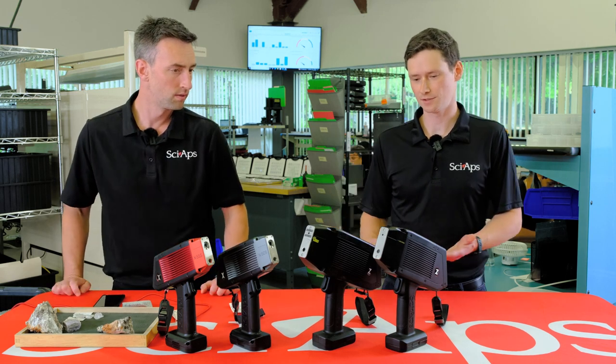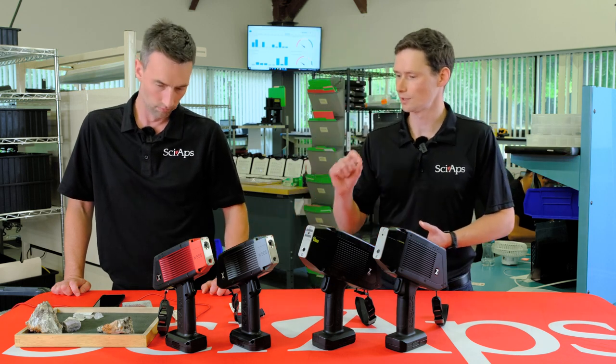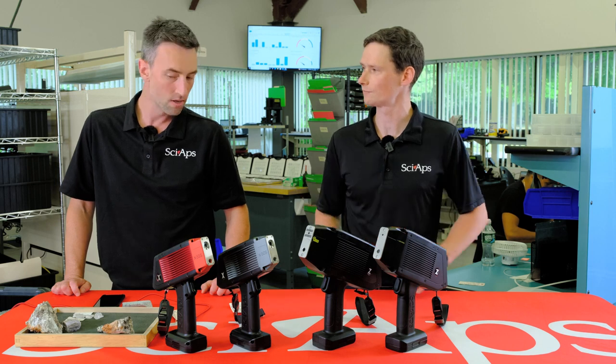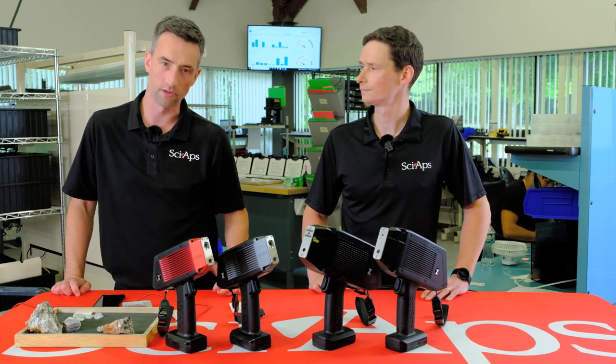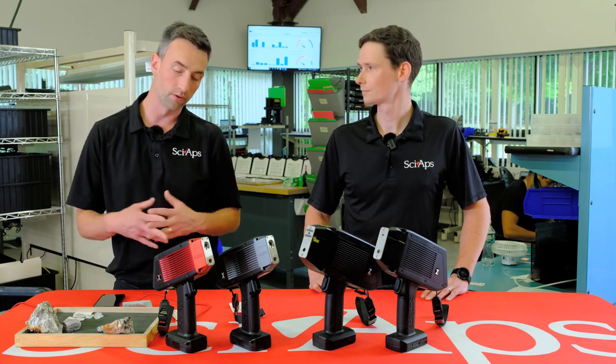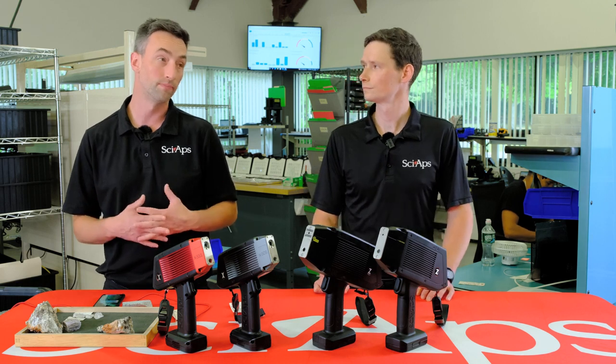So the spot size, are you saying that in a sample like this, you could actually pinpoint a small grain and potentially measure the chemistry of that one grain, even if it's really small? Exactly, yeah. So you can imagine the possibilities. A lot of the time the geologists, if they're looking at a rock, some minerals are easy to identify, others can be tricky.